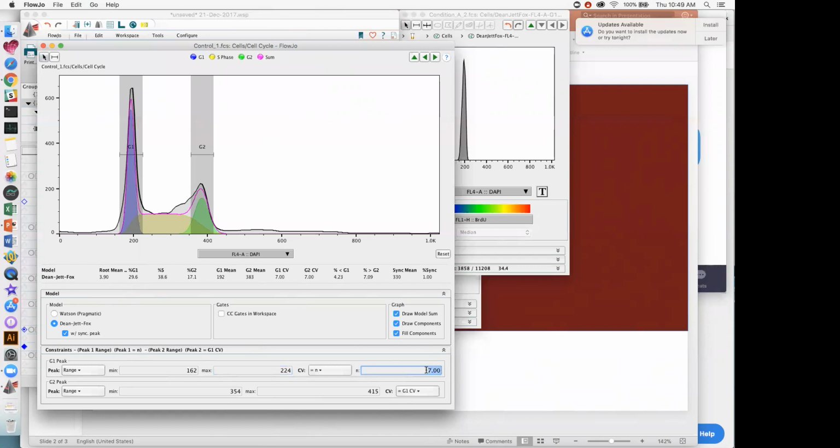Let's see what happens when we reduce it to 5. Do we increase or decrease that RMS? Okay, in the case of 5 CV, we've gone way too far, right? We've bumped this up to 7. If we're here at 6, maybe we'll improve it a little bit, right? From 5 to 6 is a huge jump. We've gone 2 points down, which is nice.